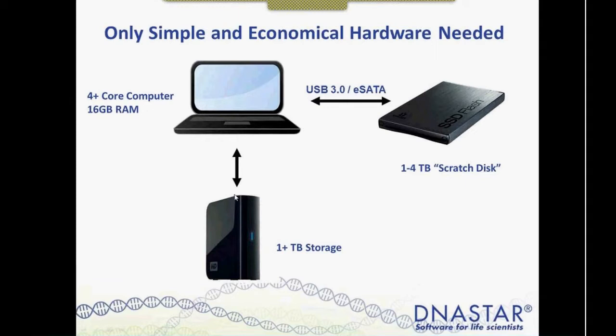At DNASTAR, I use our network drive, so I have my raw data up on the network, and that works fine. I usually save the data out locally to a local drive. And so if you're looking to set up DNASTAR software or run demos, keep in mind that with larger data sets, you'll want to have enough scratch disk space available to you.